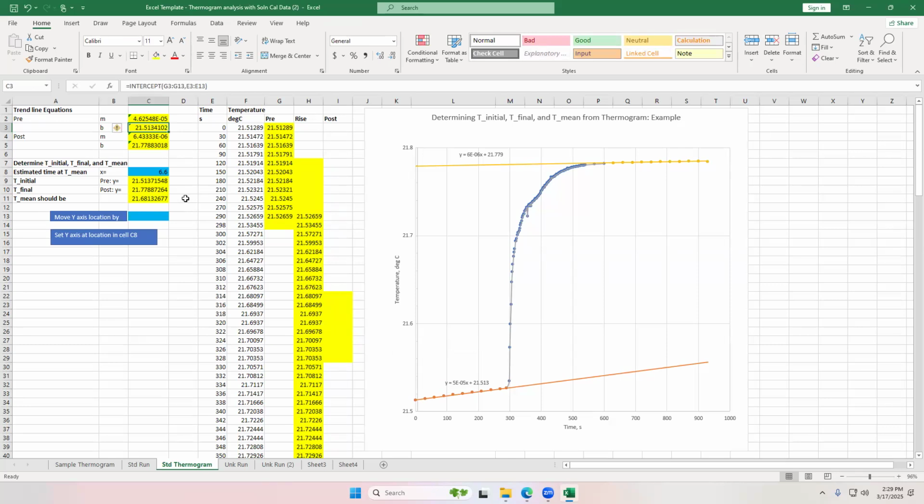All right, so everything's okay now, except that the axis that we've drawn is at 6.6. Where should it be? Somewhere between 300 and 400. You figured out it's at 315? About that. Okay, so you just say you want your determination of your mean temperature at x equals 315.